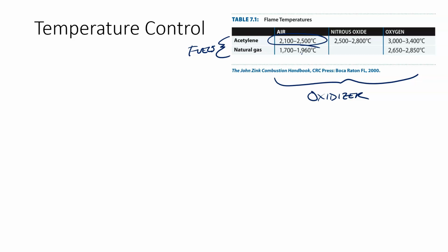Now, we didn't talk a whole lot about the Boltzmann distribution. It's part of Chapter 2, but we're going to bring it up now. Essentially, the Boltzmann distribution tells us how many atoms, in this case, are in the excited state versus the ground state at a given temperature and a given energy of excitation. So the number in the excited state divided by the number in the ground state, that ratio, is equal to the degeneracy, given the symbol lowercase g, of the excited state divided by the degeneracy of the ground state, G sub g.